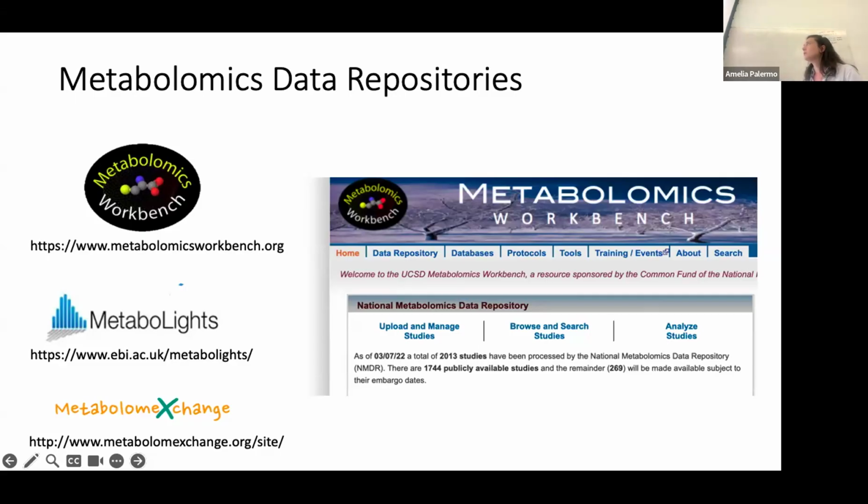We should consider that untargeted metabolomics data are really information rich. And generally, they are analyzed to answer a specific question in a specific comparison. However, that information that they contain is not completely distilled in the frame of that comparison, and it's useful to many other meta-analyses. So that's similar to transcriptomics and other omics sciences, right? So it's nothing different here.